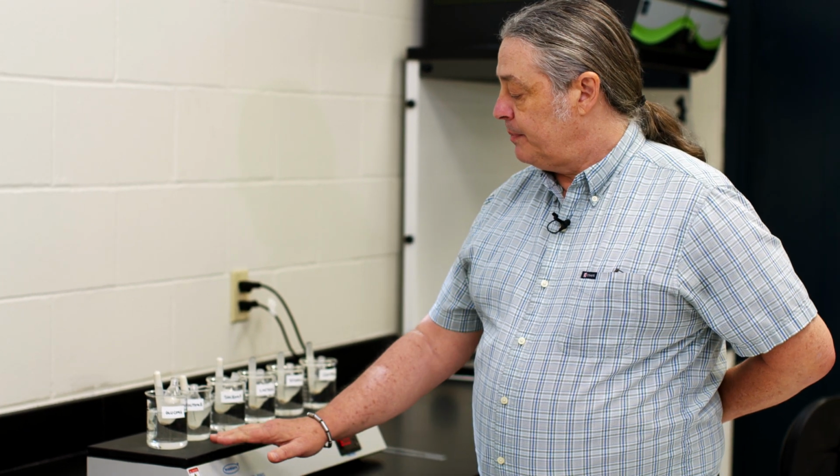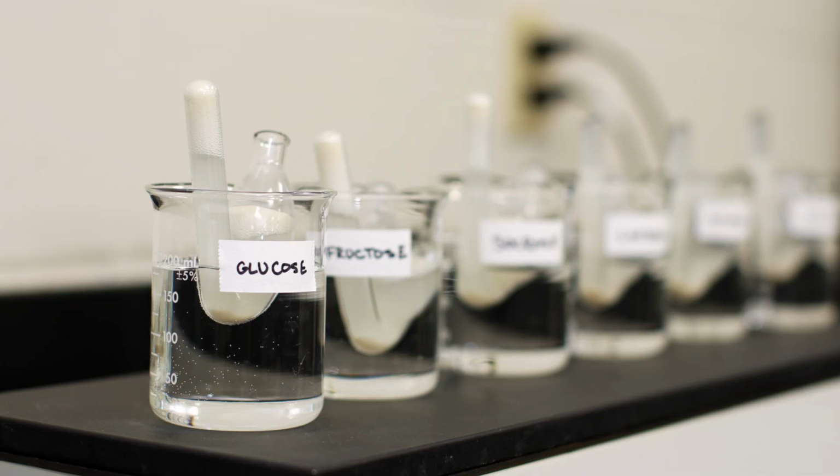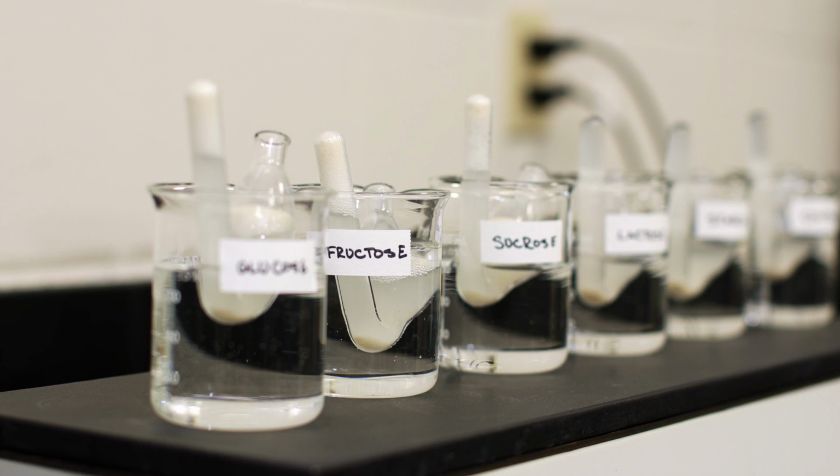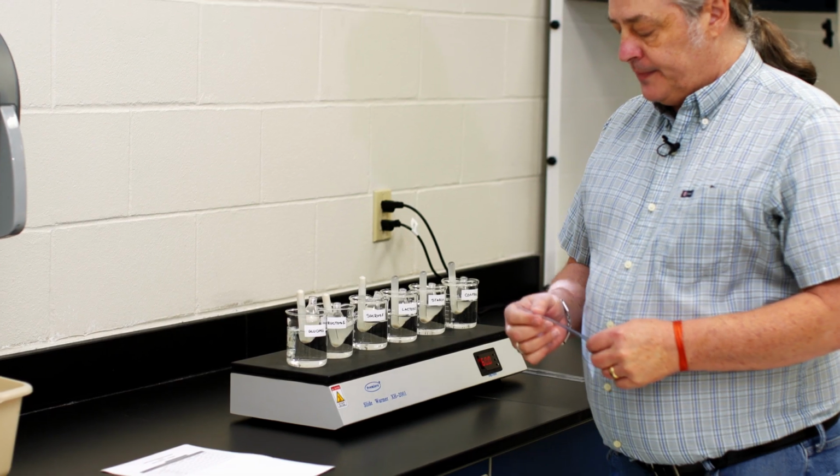And to help speed things along a little bit, we're going to place our beakers that are ready to go on a warming tray like you see here, so that they can be nice and warm and get to business with their fermentation. And the way we're going to measure whether they're doing any fermentation or not is looking for one of the waste products that we've learned about that happens with fermentation, CO2 gas being given off.